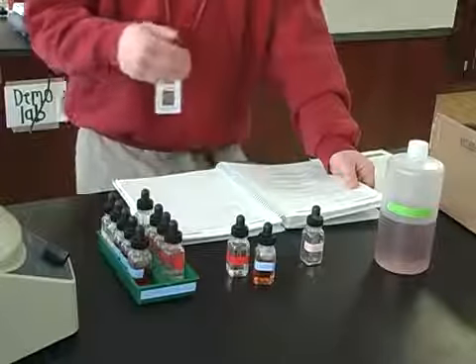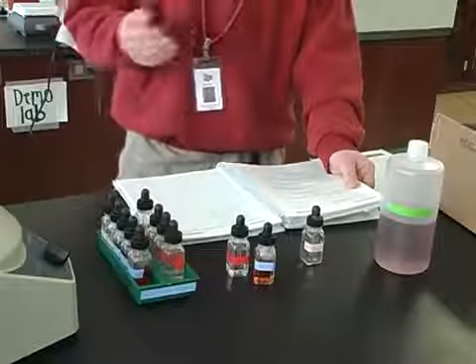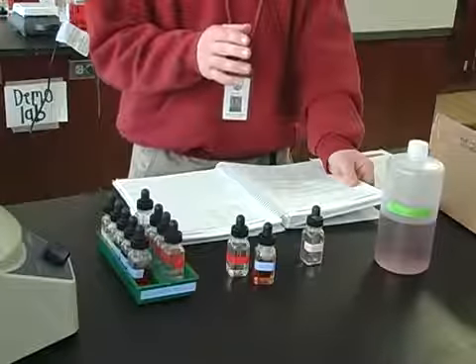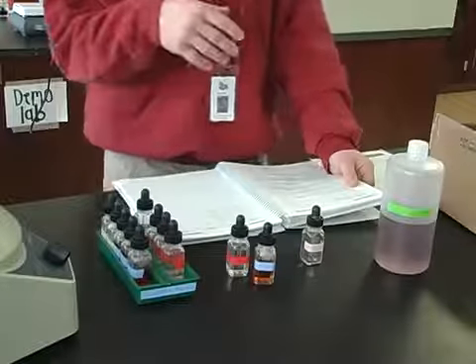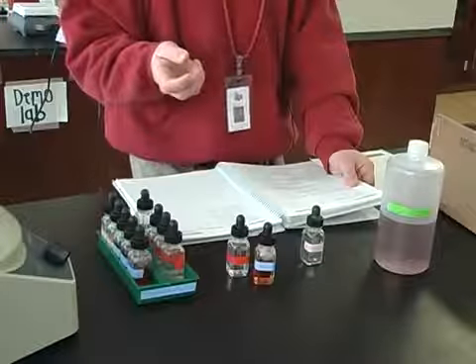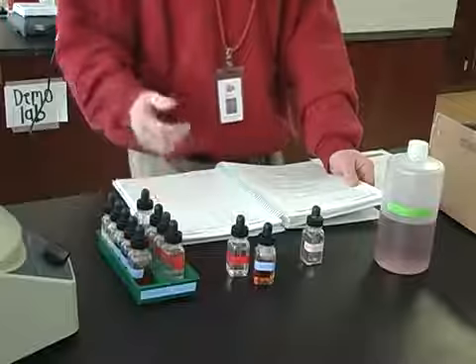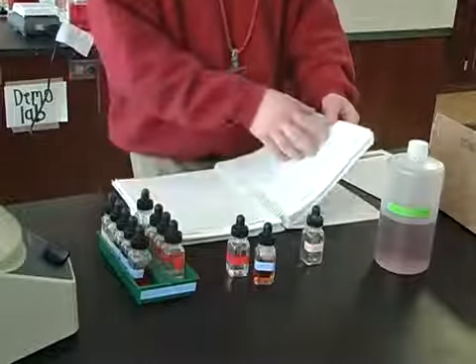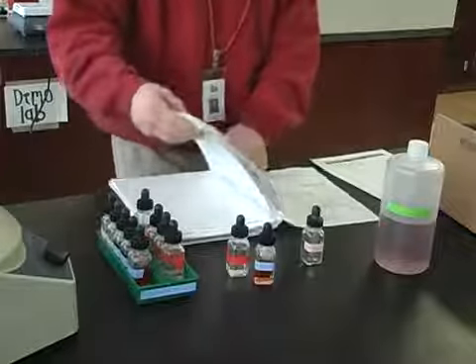But when we added that, does it tell us if there's silver in there or not? It doesn't tell us for sure, does it? We'd have to do a confirmatory test with the liquid, with the solution, to find out if silver's there. So we have to say that silver is undetermined in number 2. Okay, let's do one more.